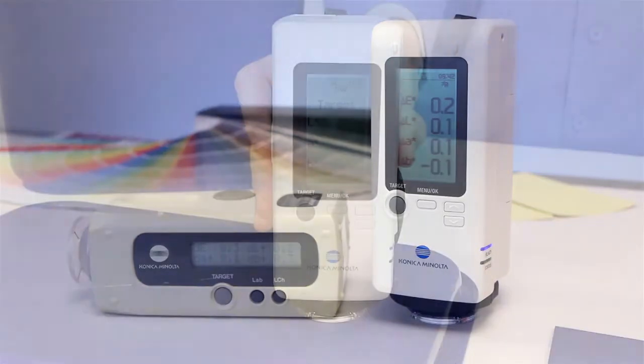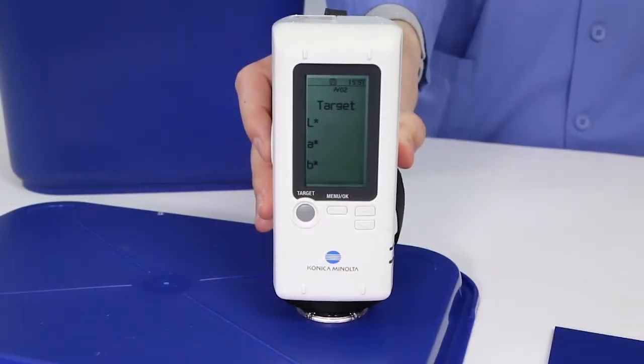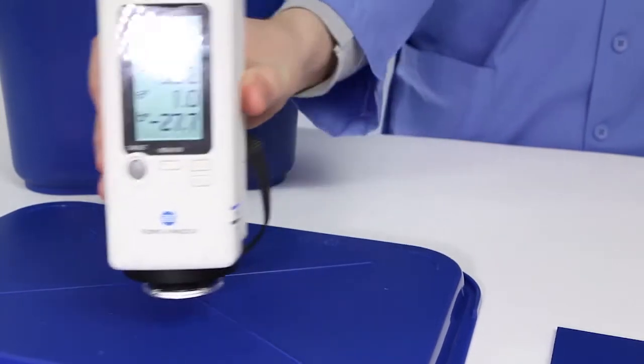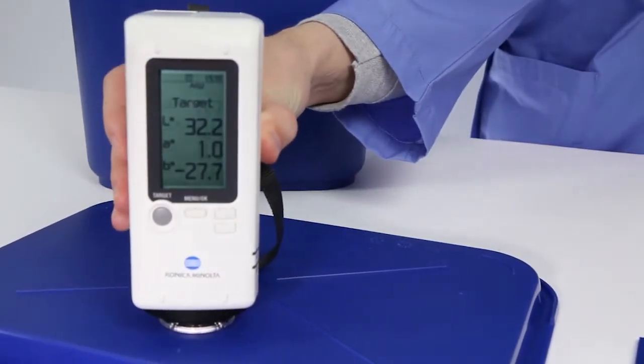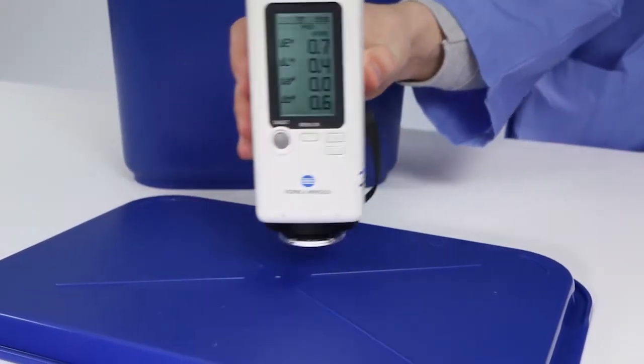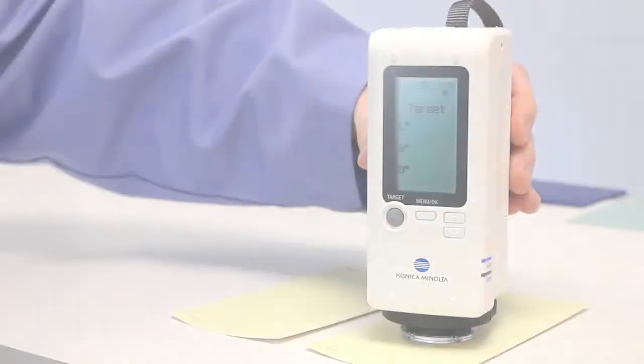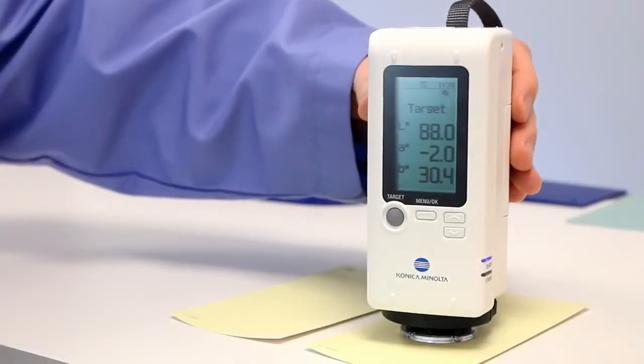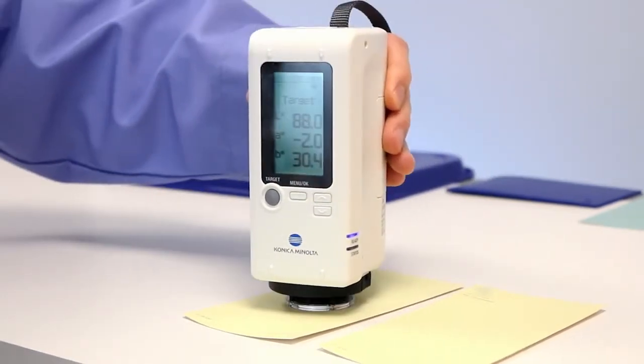This new design, combined with a built-in xenon lamp light source, ensures accuracy, repeatability, and ease in a variety of measuring conditions. The CR-10 Plus Color Reader allows you to measure color difference with confidence.